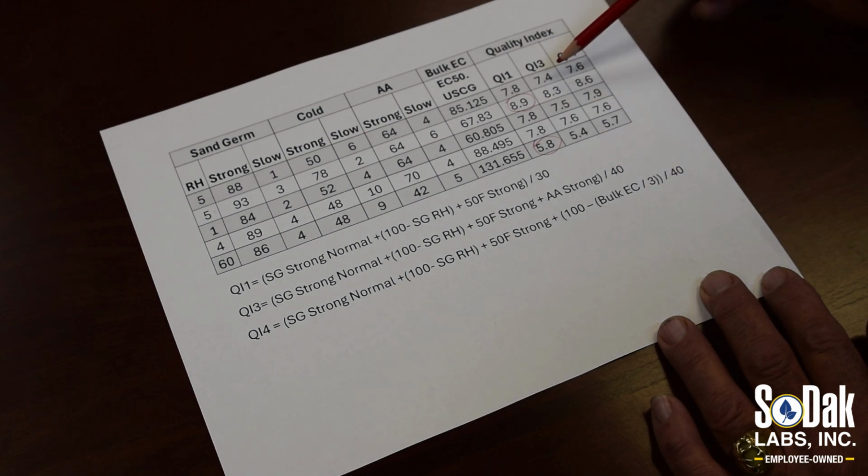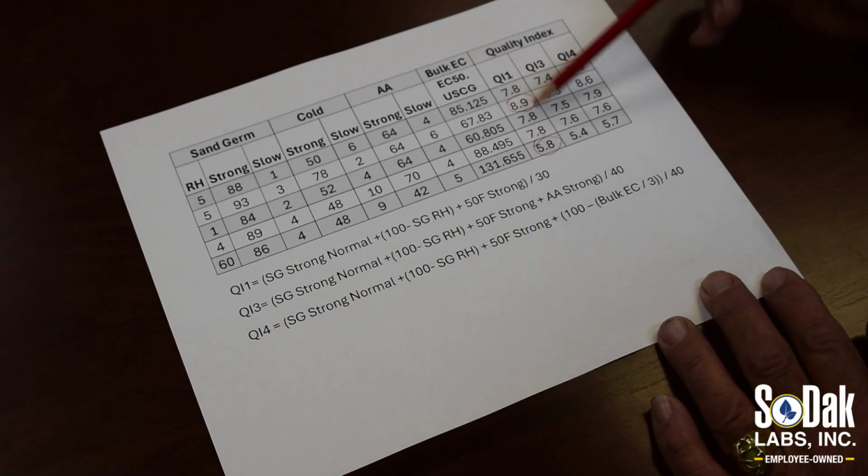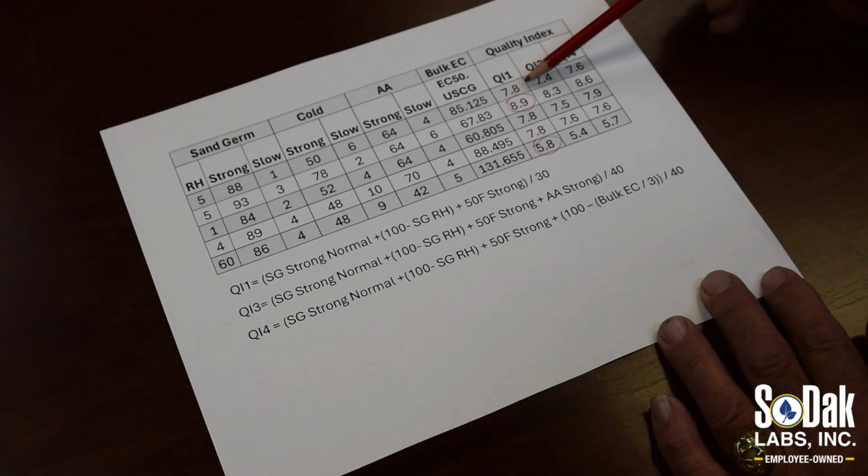And you know, the question is, this costs more money to do than this, so do we gain anything? And what we see with that 4th variable in there, it does reduce the index from about 0.4, 0.6, 0.3, 0.2, 0.4. So the rankings of these seed lots really didn't change greatly.